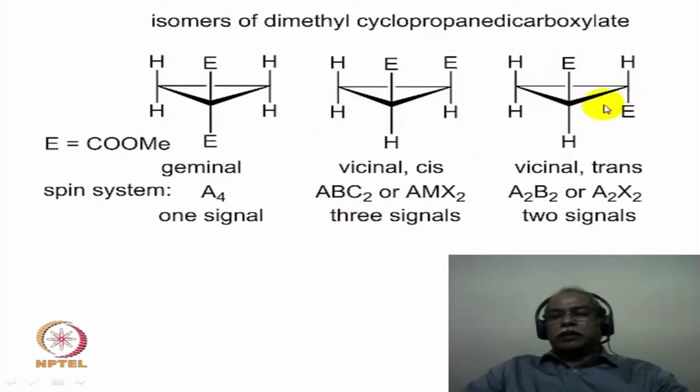And if you look at this particular compound, here there is no plane of symmetry. However, there is a C2 axis of symmetry passing through this carbon and through the middle of the carbon-carbon bond bearing the ester functional group.